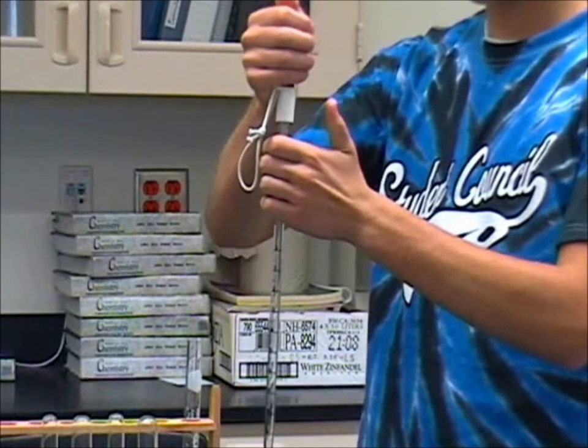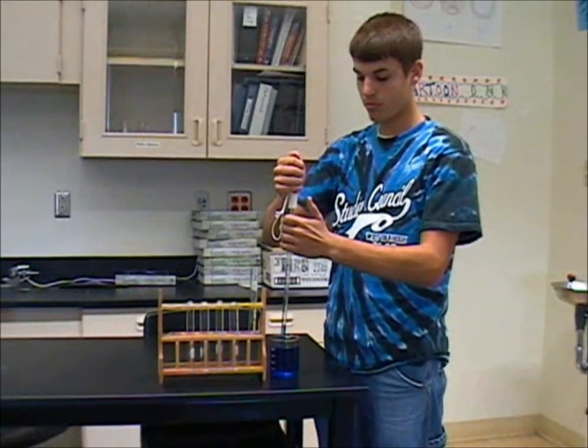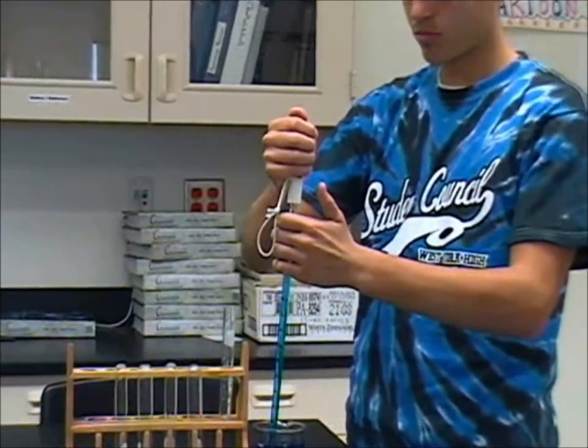Squeeze the bulb firmly and place the pipette into the solution. Slowly release the bulb while the solution gathers inside of the pipette. Let the solution fill the entire pipette.